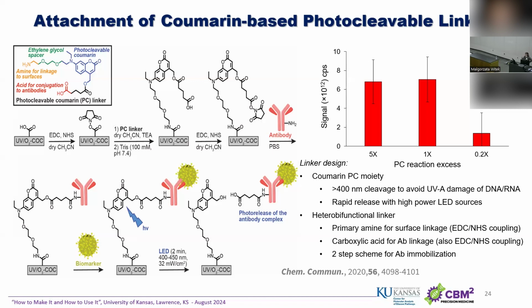A lot of our collaborators seek that kind of analysis where you isolate biomolecules or cells, or I'll talk about exosomes later, for example. We isolate, we present them with a tube of material that's isolated, and they can perform benchtop type of analysis.